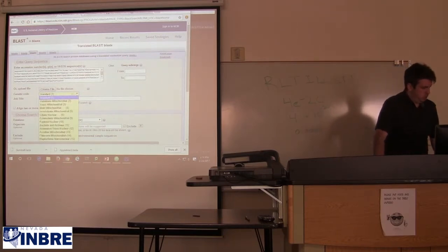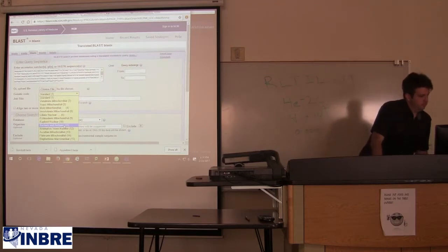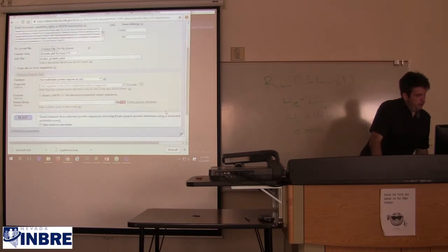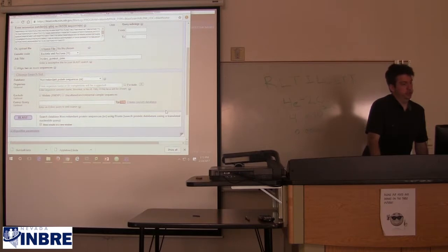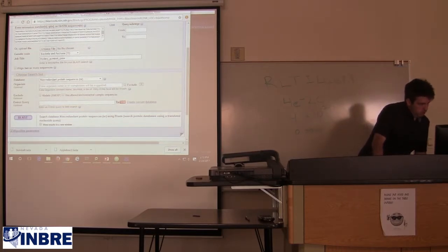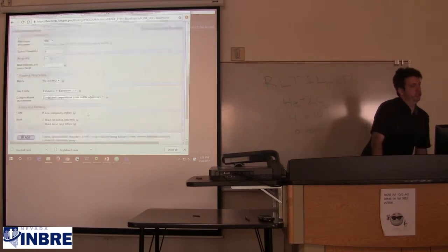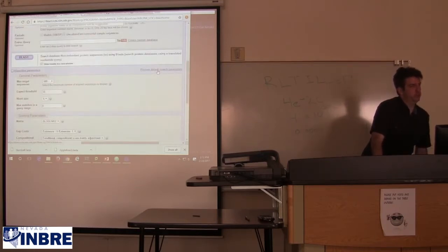Genetic code, 11 for bacteria and archaea. Those are settings that are also used at Phages DB, and I figured they know what they're doing. The search database is fine. We don't know if gumball is in NCBI yet or not, so we want to search everywhere. Algorithm parameters, if you see anything that doesn't look like it was the defaults, you can always hit the restore default search parameters button.